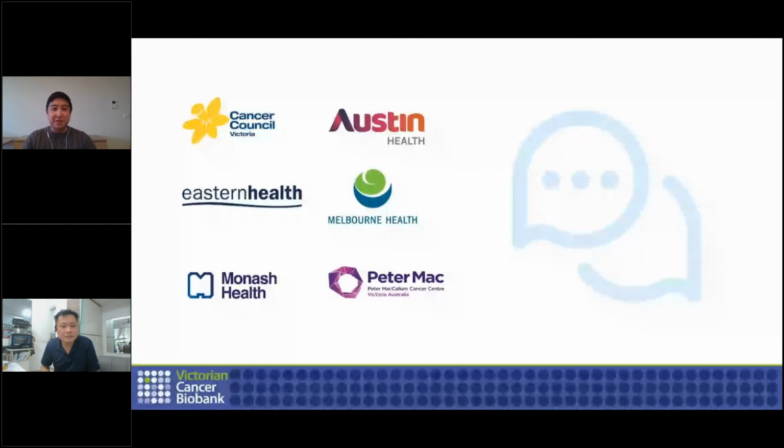Sure. I'll probably preface that the VCB doesn't use e-consent at this stage. Shri, would you be able to elaborate on your e-consent plugin? Yeah, so e-consent is a relatively new module introduced in the last year, now being used in 3 centers in the US. And about the legality part, I think that's more country specific and less of an IT or a software problem than the policies and how you implement it.